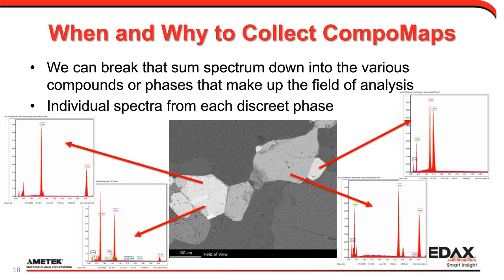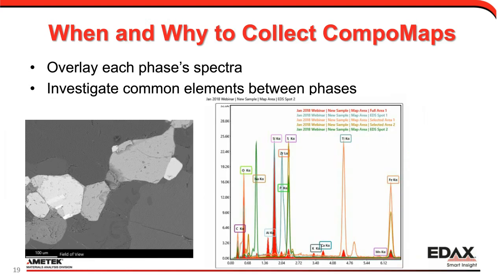And the key there is that we're looking at site-specific chemical information from each of the different areas. Now we'll look at the sample and the spectrum in a slightly different view. So we've gone back to viewing just one single spectrum view, but what we've done is we've taken those individual site-specific spectra and now overlaid them. And you can see various peaks of various intensities.